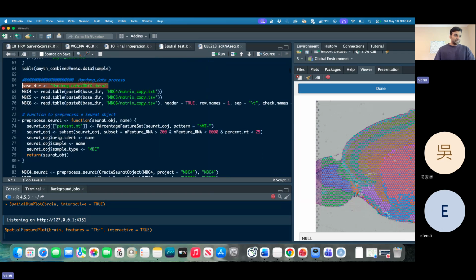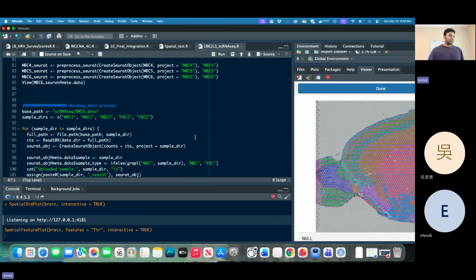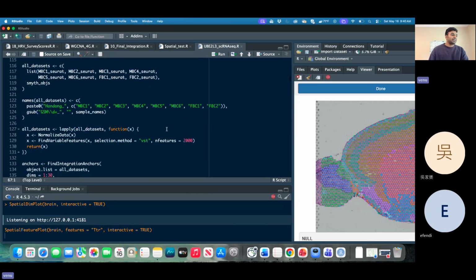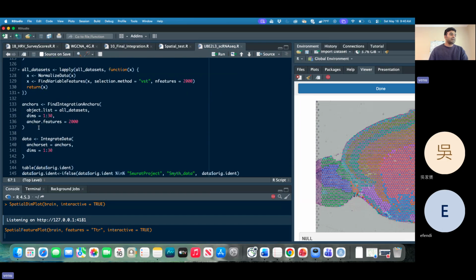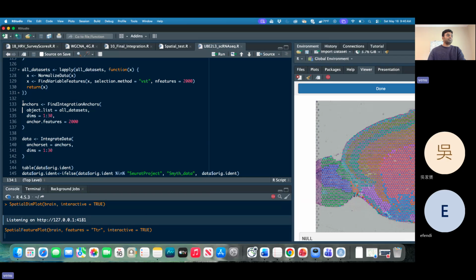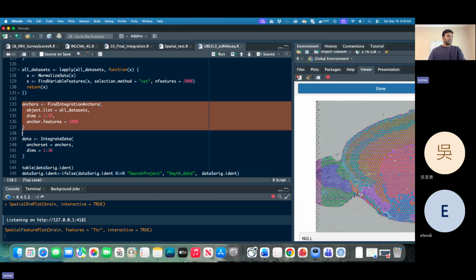Initially I just remove the small, not important single cells. Then these all are filtering techniques, and this is what will take time. Now I think there are more updated methods.